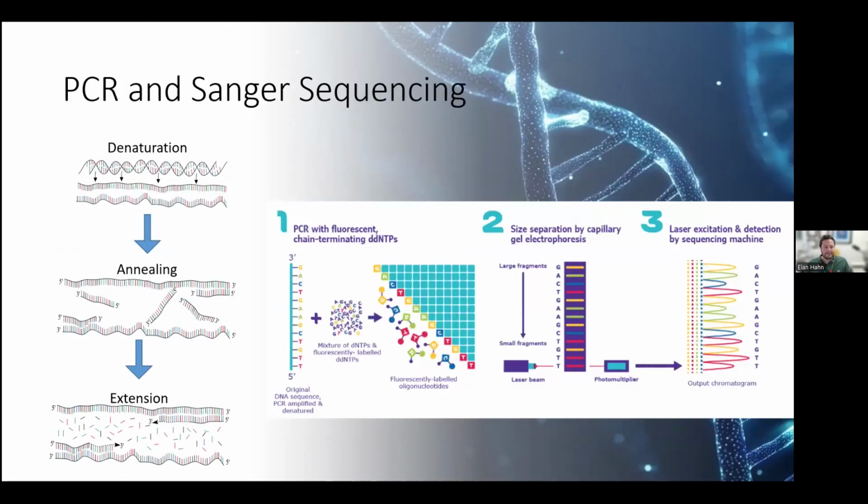And there are different types of sequencing. So there's PCR, polymerase chain reaction, which is multiple cycles of denaturation, annealing, and extension, which can be quantified as well, looking for the production of fluorescent signal that increases as we increase the amount of our target sequence.